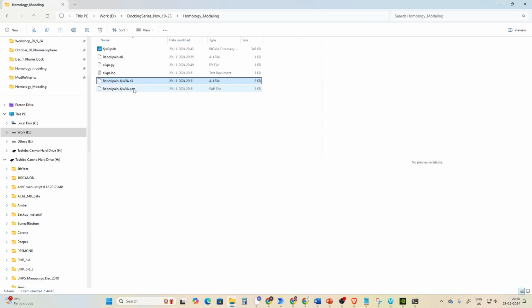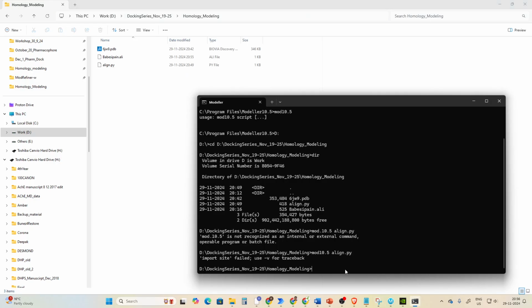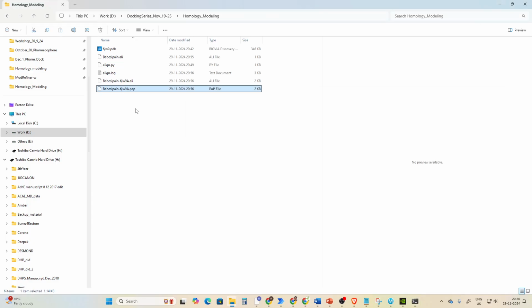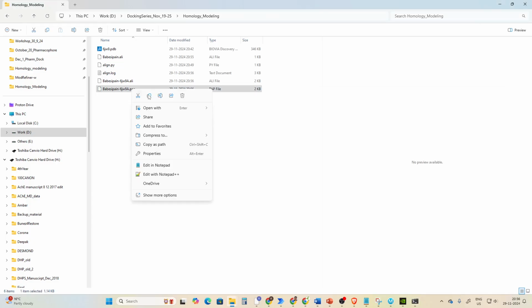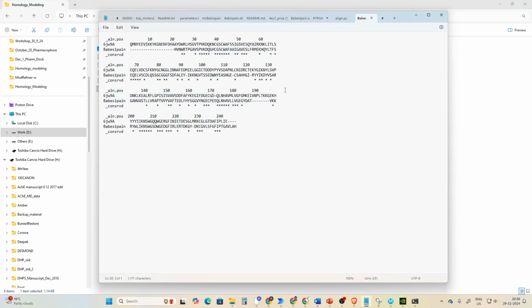Let's delete this. This again. Go to new alignment files, you open and see. All right, this is better now.